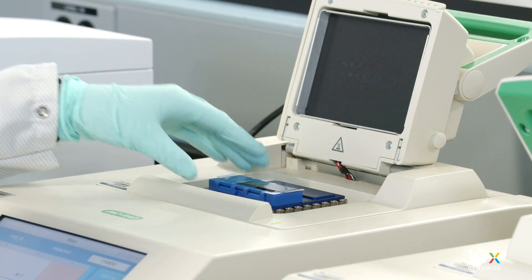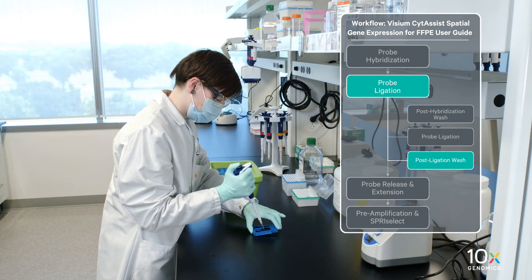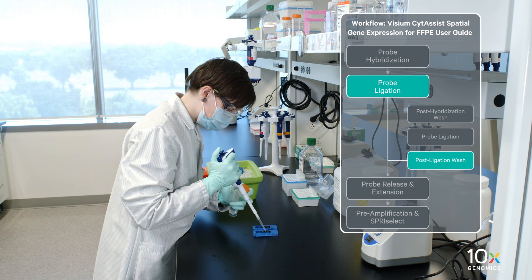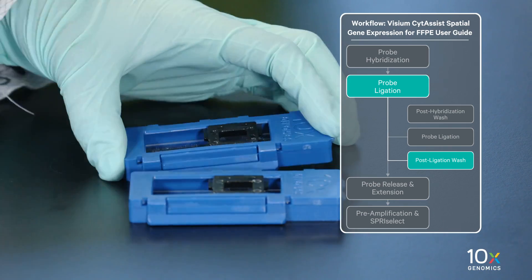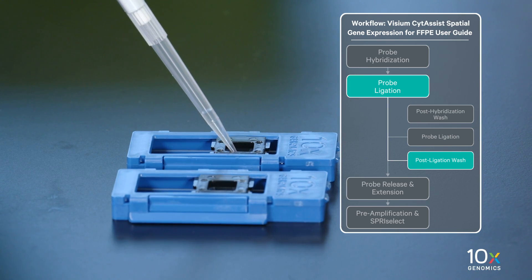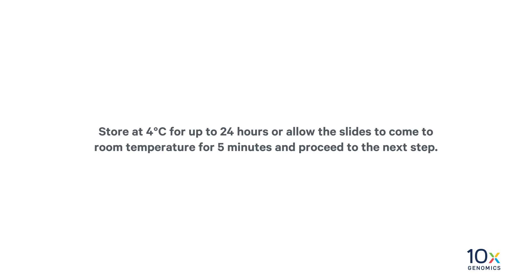Remove the tissue slide cassette from the low profile thermocycler adapter and place on a flat, clean work surface. Remove the Visium Slide Seal. Using a pipette, remove all post-ligation wash buffer. Add 300 µL of 2X SSC buffer to each well. Remove all 2X SSC buffer. Add 300 µL of 2X SSC buffer to each well. Apply a Visium Slide Seal on the tissue slide cassette. Store at 4 degrees Celsius for up to 24 hours, or allow the slides to come to room temperature for 5 minutes and proceed to the next step.